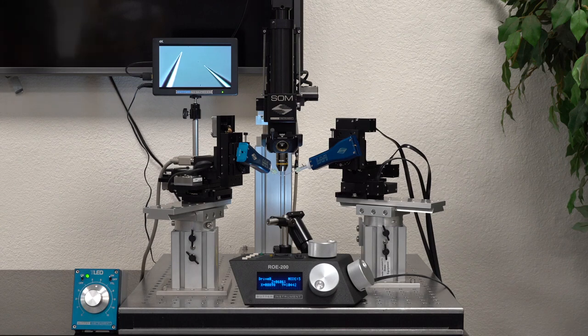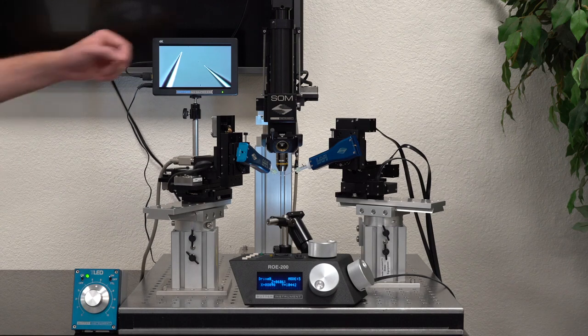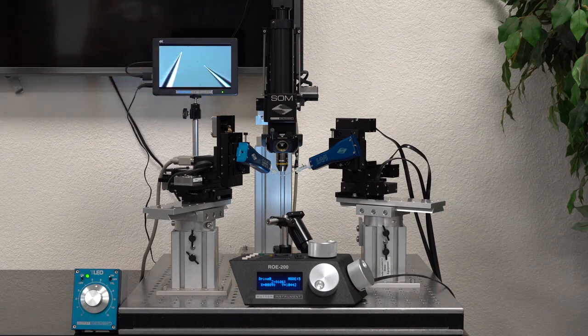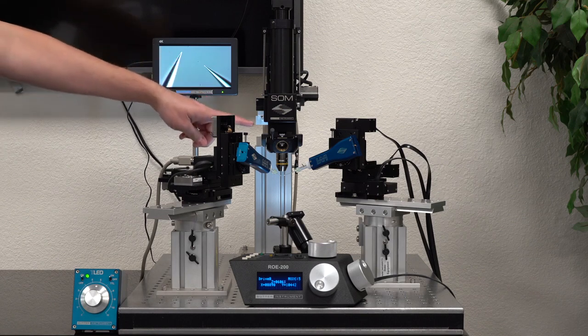The SOM can accommodate two RMS thread objectives on the swing nose piece. A single larger diameter objective can be mounted by removing the swing nose piece and this aluminum block.